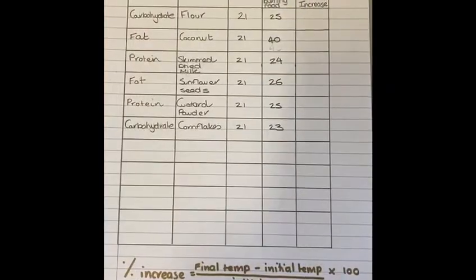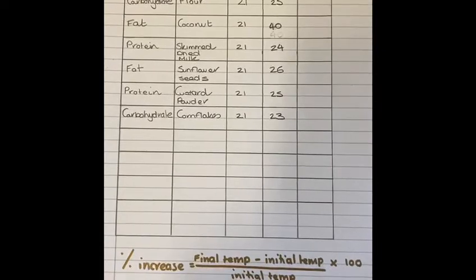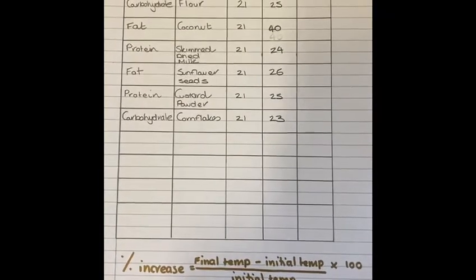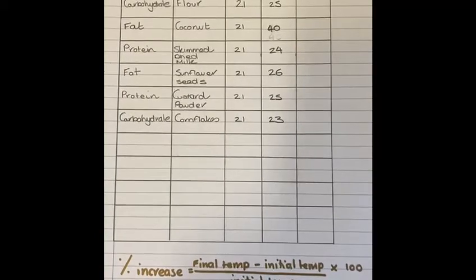Having burned all 6 examples of food, measured the water temperature at the beginning of each investigation and also after burning food, the results table is nearly complete.